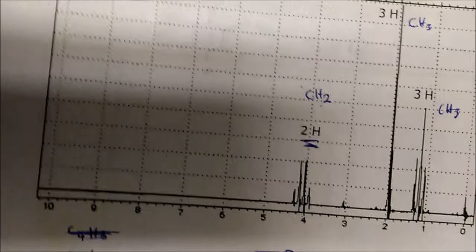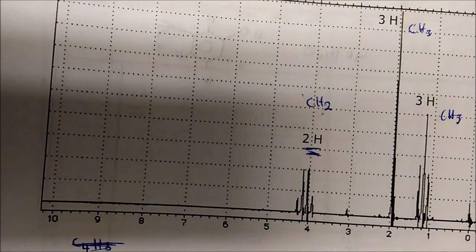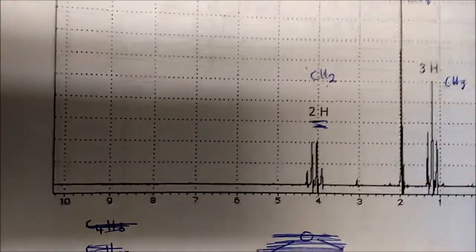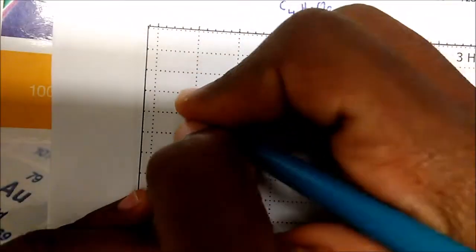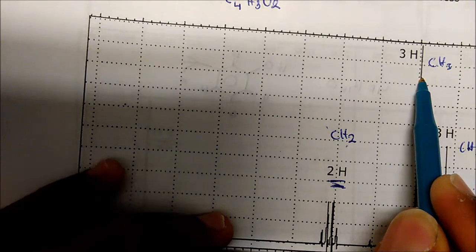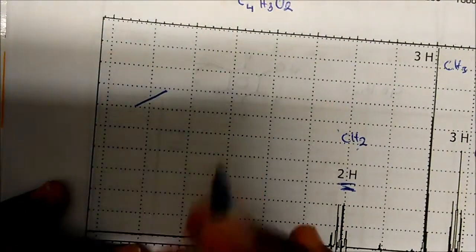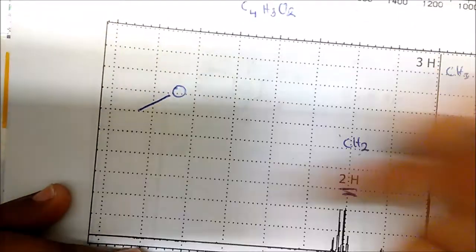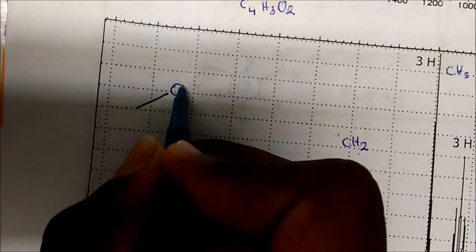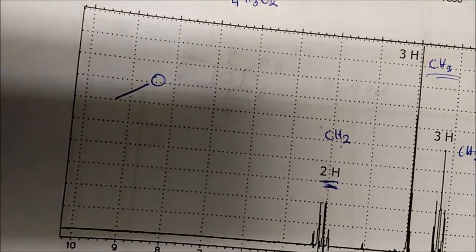The first thing I'm going to do is draw my CH3. This is just one of the most difficult things with NMR spectrum - you can't really teach it, it's just something you're going to have to do, but it's nice to see how I solve them. Now I'm going to draw my CH3 in such fashion that it only splits once. I'm going to draw my CH3, and the only way for this CH3 here to split once, I'm given an oxygen, so I'm going to use that oxygen. Notice that my CH3 has zero neighbors, so therefore zero plus one is one, and therefore I will only see a singlet, which is concurrent with what I see here.